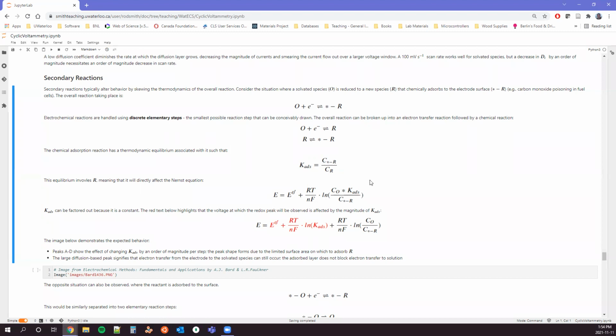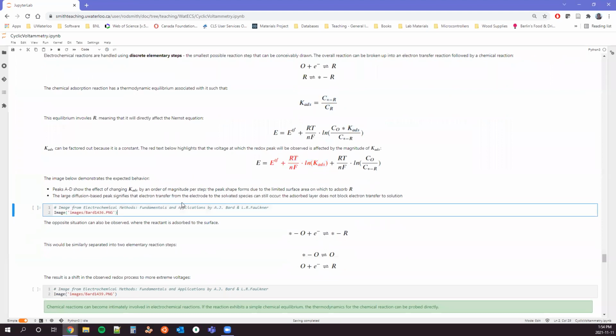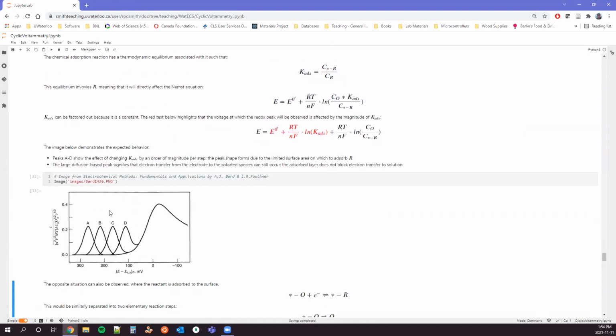We can factor that into our Nernst equation. Because K adsorbed is a constant, we can factor that out. And so applying some logarithmic identities, we can take that out. Now we can group together all of our constants. And so this red highlighted species tells us that our formal potential is going to be modified by some constant, right? And so as we change that constant, what we see is a change in thermodynamics for the overall process, right? And so what we have here is basically the embodiment of Le Chatelier's principle, affecting our electrochemical behavior, right?